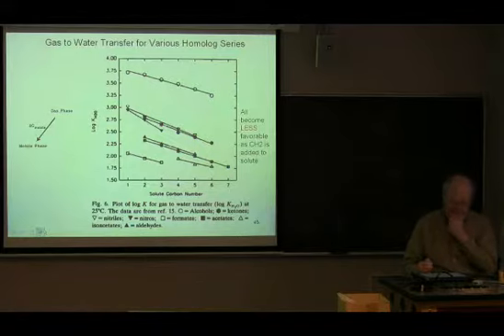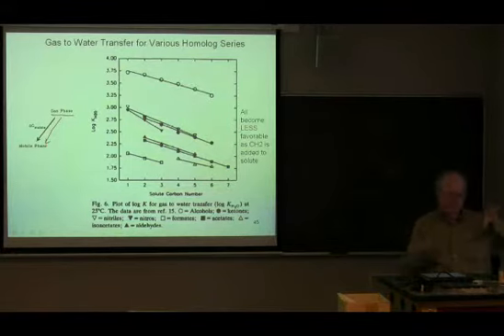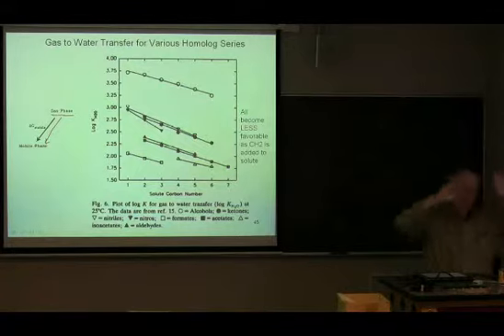This is a little tougher measurement. This is the measurement of the gas phase to mobile phase using water as the mobile phase. So we now have, if we can get this, two legs of that triangle, and we can compare that result to the direct reverse phase process.